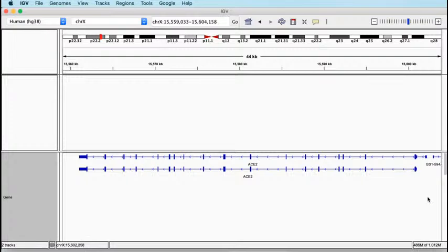So just as a genome browser with some packaged annotation, IGV is sparse, especially compared to the default view in UCSC, or in Ensembl as well, where there's a lot more data. But we can load data into IGV to add to the richness.